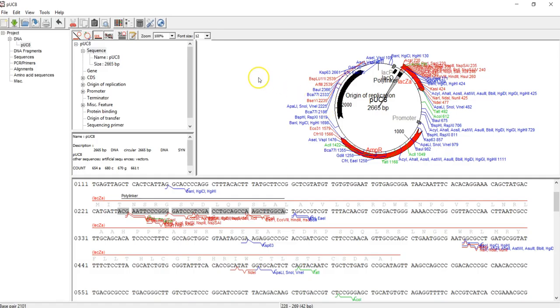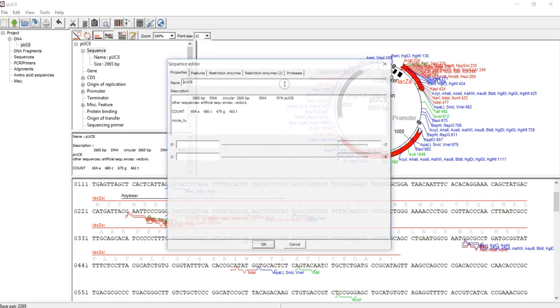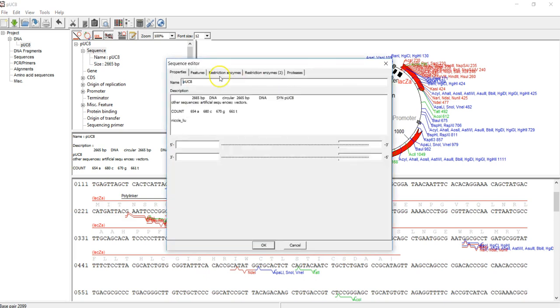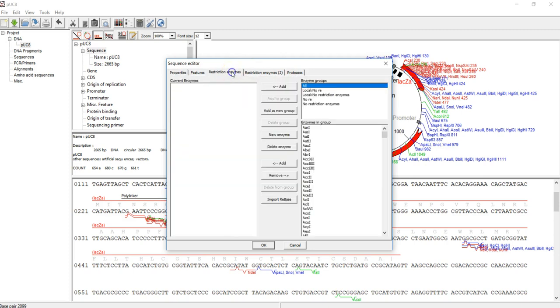With these restriction enzymes in mind, first of all in the graphic panel, right-click 'Edit Sequence.' Now in the pop-up window, you click the first Restriction Enzyme tab. There are two restriction enzyme tabs, but right now we click the first one first.